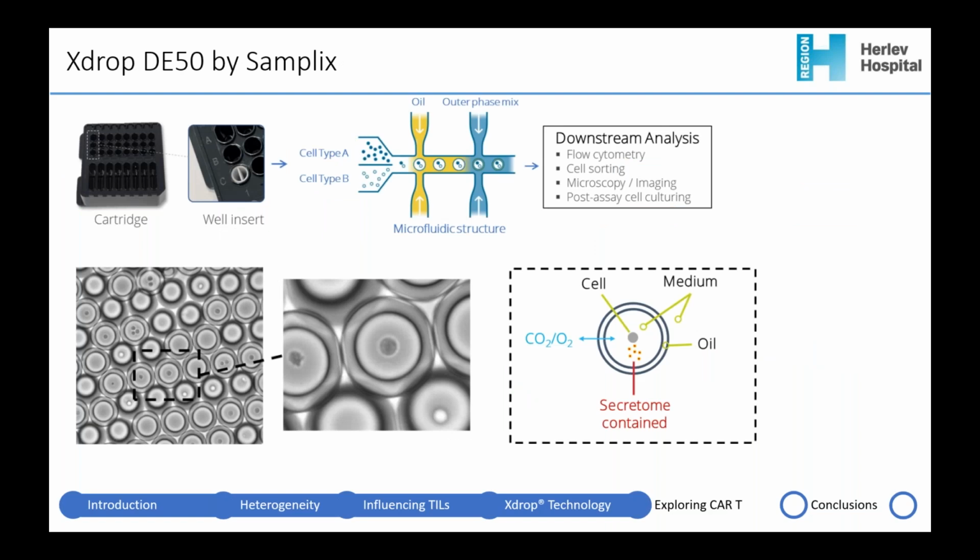So just to first show the anatomy of the droplet and what exactly we're talking about here, the cell can actually be encapsulated into this bilayer where it can exchange nutrients, but it still contains all the secreted chemicals. And they just sit here with medium on the inside and on the outside of the droplet. So the structure and the function of the technology is quite intuitive.